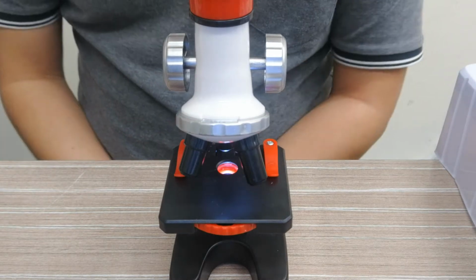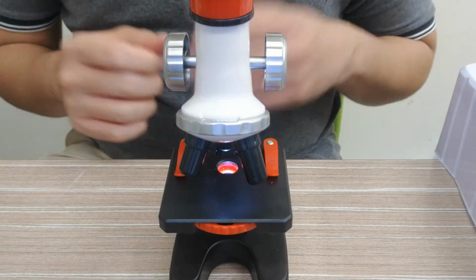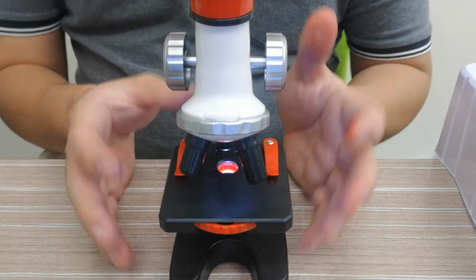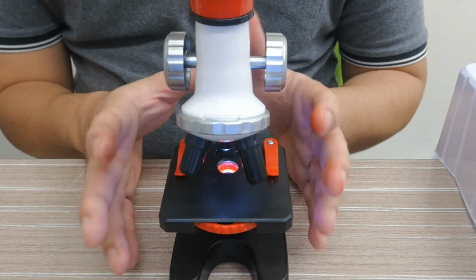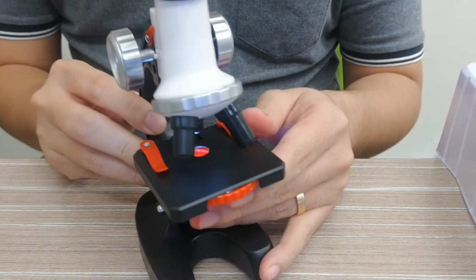In this video, I will be showing week number 2 of the experiment, where we're going to observe the onion cell. This is the first time they are going to have their own microscope. Let me explain a few features.